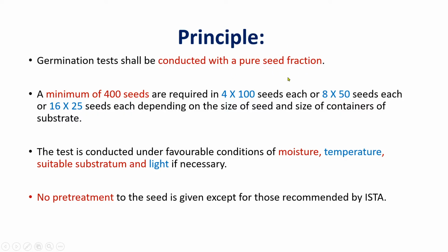Coming to the replicates, a minimum of 400 seeds are required. How much seed is required for testing? It is 400 seeds, sown in 4 replicates of 100 seeds.